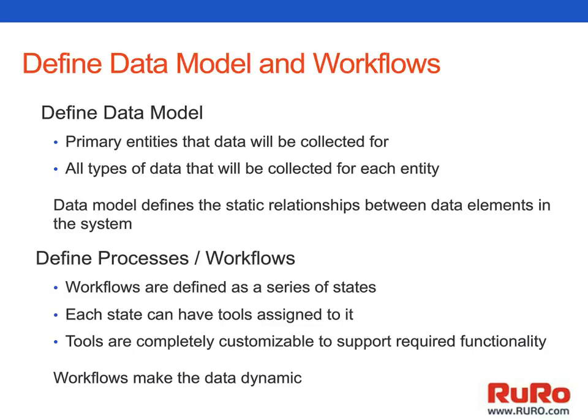If it was a biobanking solution, we want to talk about maybe files, maybe patient information, specimen storage, whatever it is. And then on top of those subjects, we want to talk about the actual data that will be collected for those subjects. So this is an excellent opportunity, when we start talking about doing these data models, to focus on data standardization.